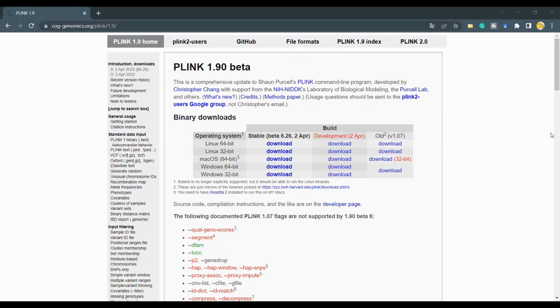The PLINK website is an invaluable tool and a crucial point of reference whenever you work with genomic data and with the PLINK software. In this video, I would like to show you my 3 favorite parts of this website, and coincidentally, the ones that I use most often. The first of these places is the file formats, which is located in the top of the screen.